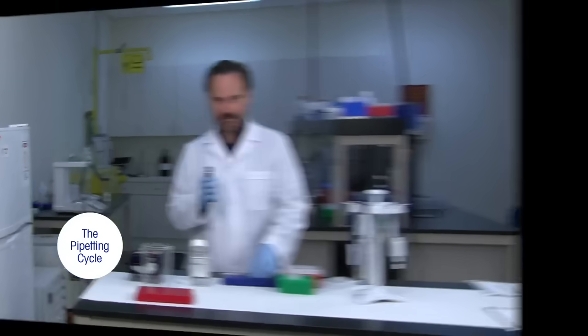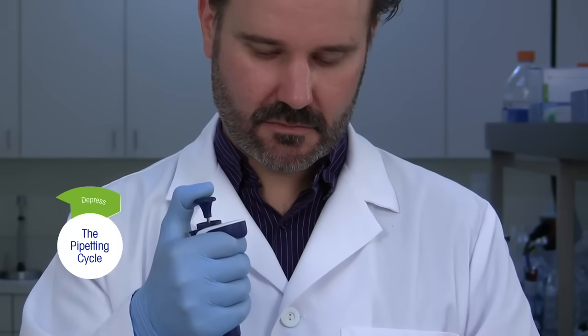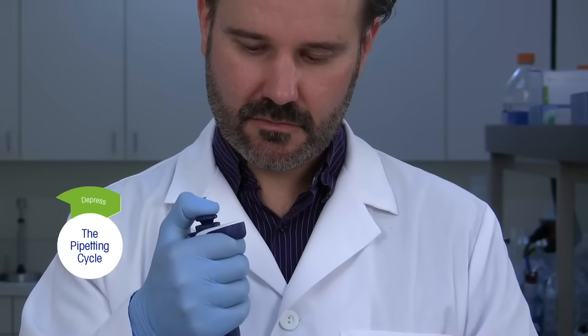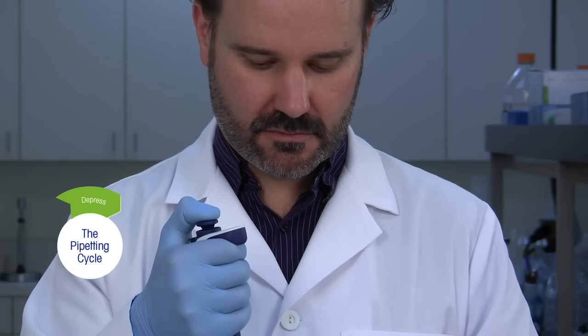Step 1. Starting at the pipet's home position, push down on the plunger button until you feel it reach the first stop, then hold.